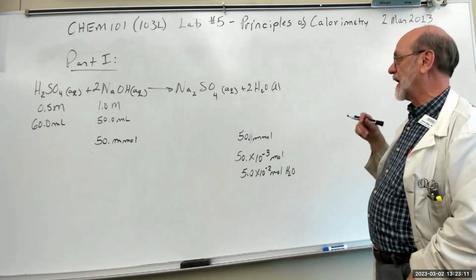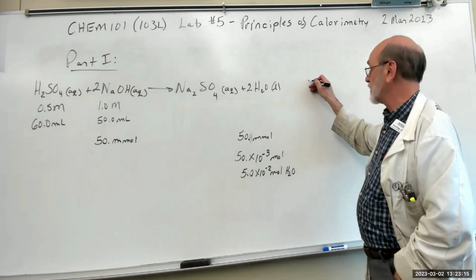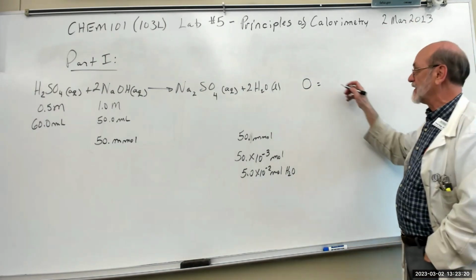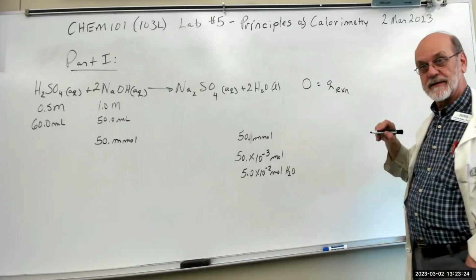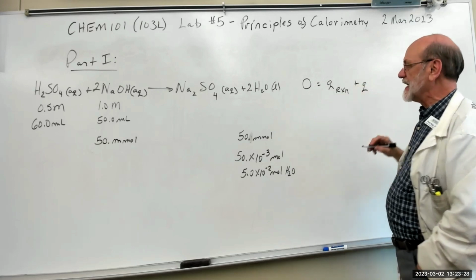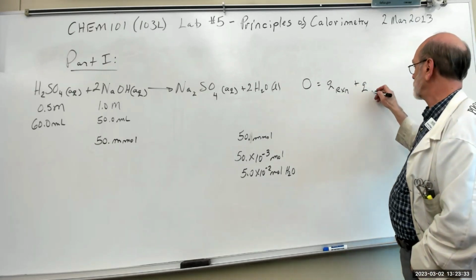Okay, so what would the equation look like? Right? It still starts off with 0. Right? You're going to have the heat of the reaction. Correct? And then you're going to have the heat of the water.